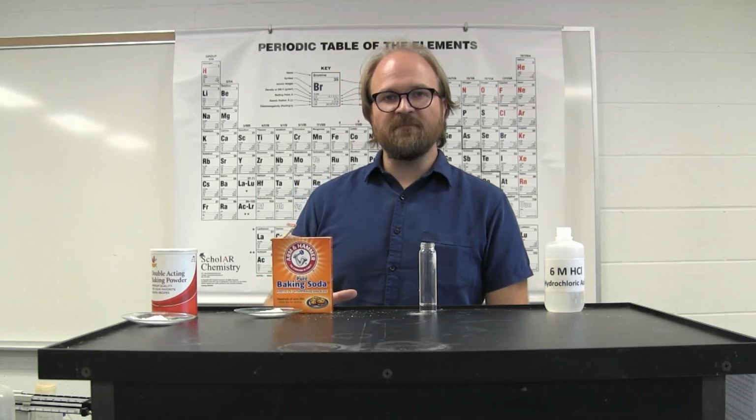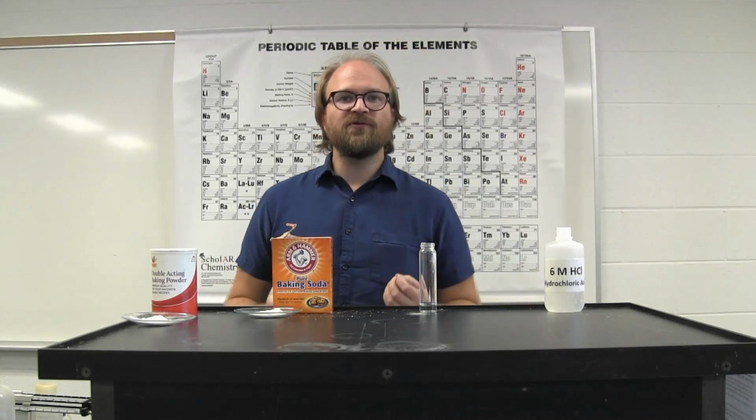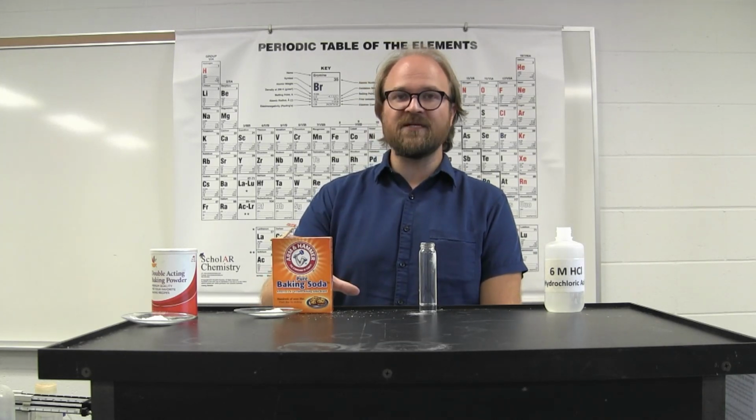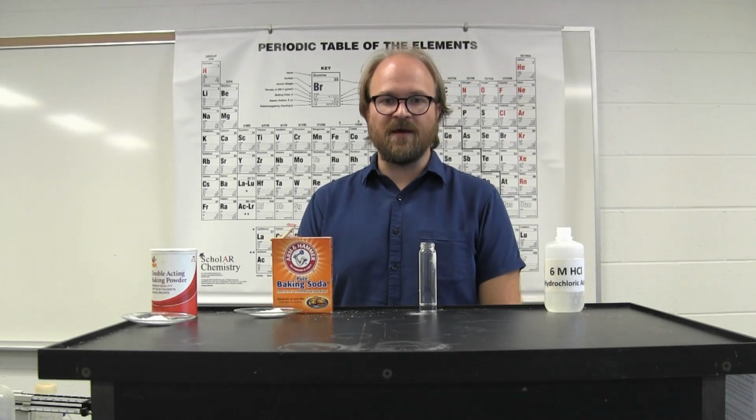Overall, this experiment is focusing on measuring the percent composition of something, in particular the percent composition of different carbonate compounds.